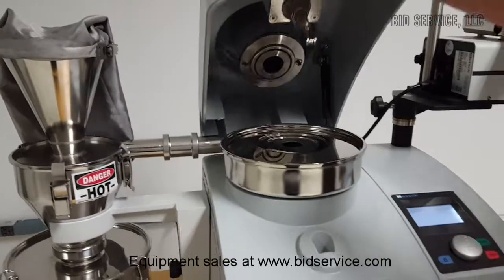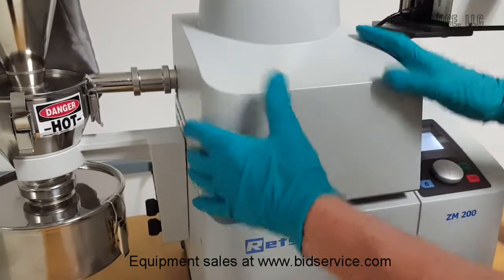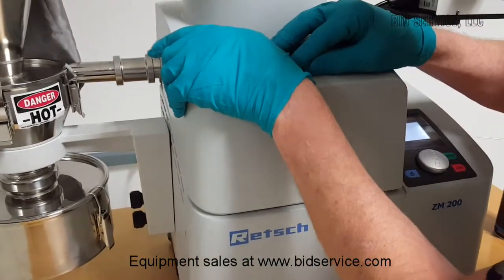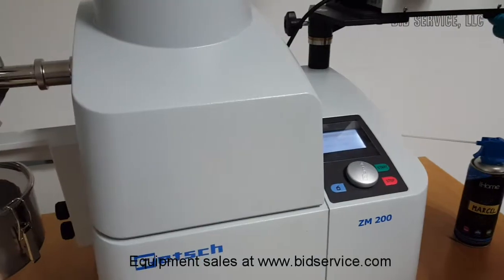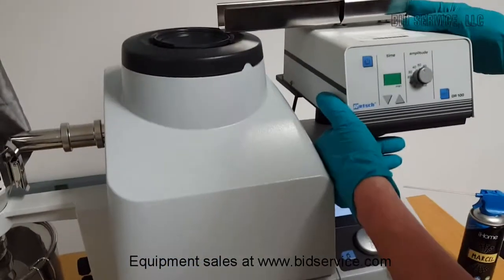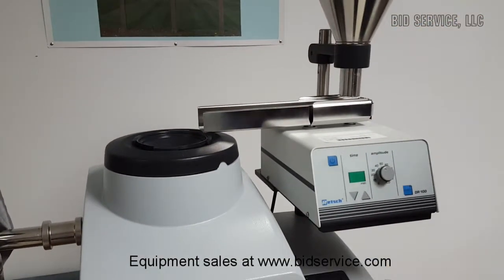Now, close this lid. When you close this lid, it will lock itself in place — just give it a slight push. Now that it says 'press start,' you cannot open this. This is the vibrating feeder. All of this can be synchronized through a certain process running time as well.